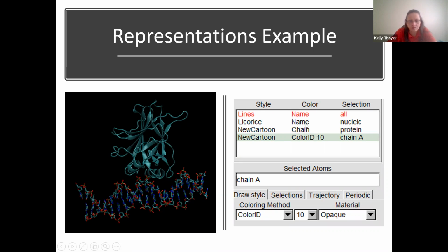This means basically being colored by the elements. So the typical CPK coloring where oxygens are red and carbons are this cyan color and so forth. There are no hydrogens in crystal structures, which is why we don't see any white, but you can use that representation to identify the atoms using their colors that you're used to from standard chemistry.